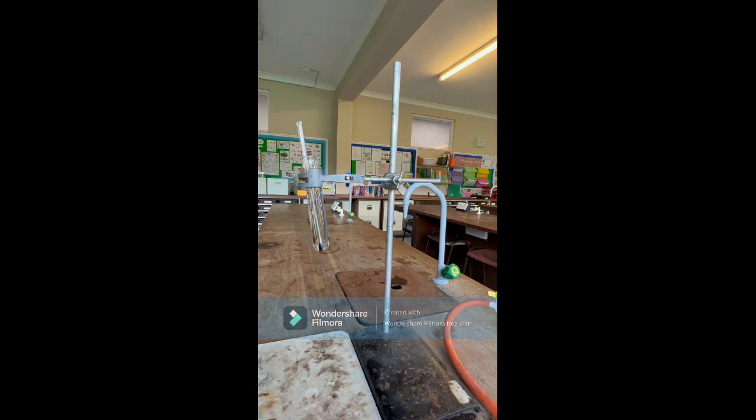I am going to light my crisp using the Bunsen burner and place it on fire underneath my boiling tube. This is going to smoke a lot, but I am going to leave it here until it is completely burnt out — until it will no longer light anymore. I am holding it quite close to the bottom of my boiling tube. You can see there is some fat already dripping off of this crisp. I need to minimise the distance because holding it further down is going to affect my temperature change, and that is one variable that you also need to control.